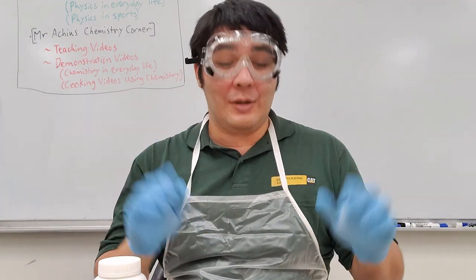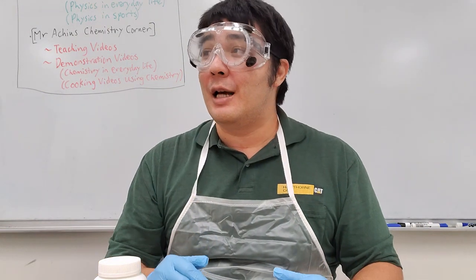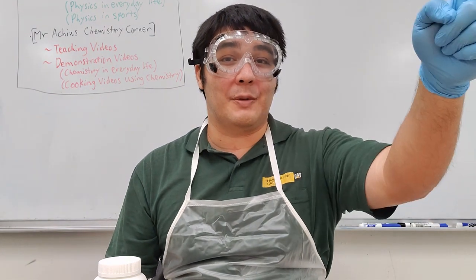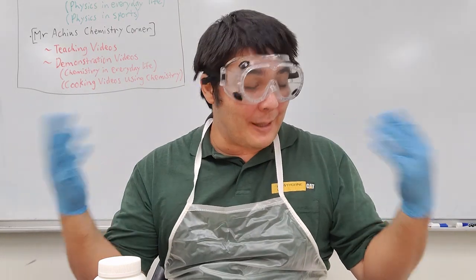But before we do that, we should always have some class participation on this one. So let's do this. Class, what do you guys think? What type of chemical reaction is this going to be? Yes? Single replacement. Very good. That is correct. And now let's take some hypotheses.